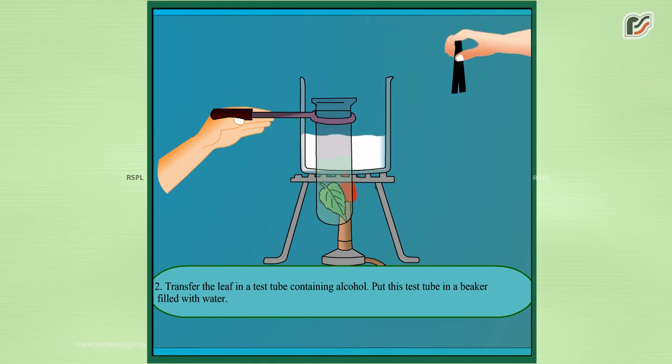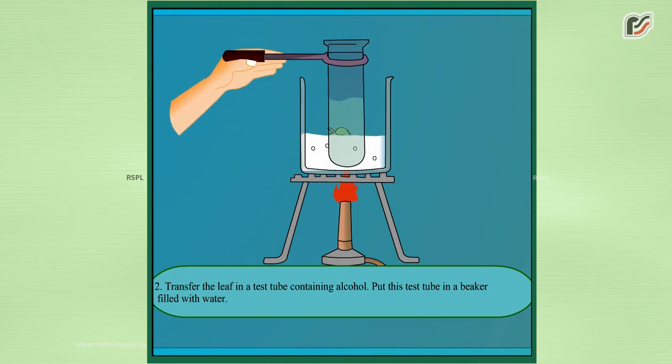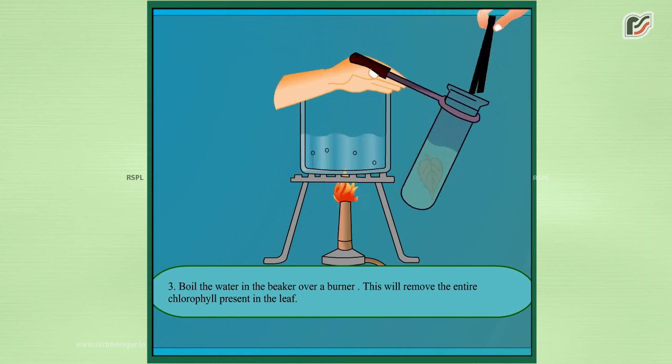Put this test tube in a beaker filled with water. Boil the water in the beaker over a burner. This will remove the entire chlorophyll present in the leaf.